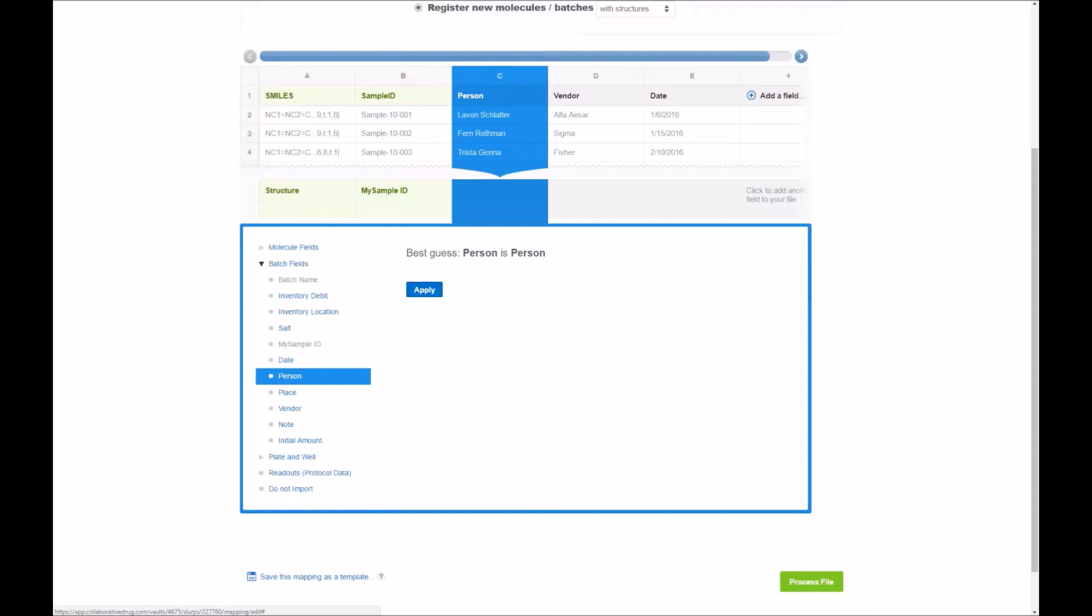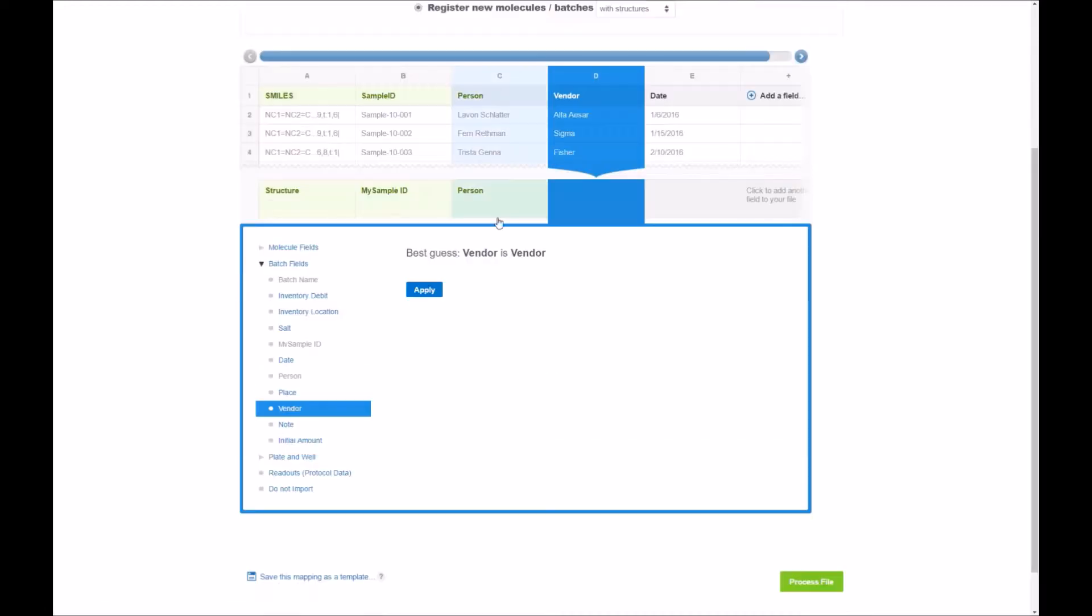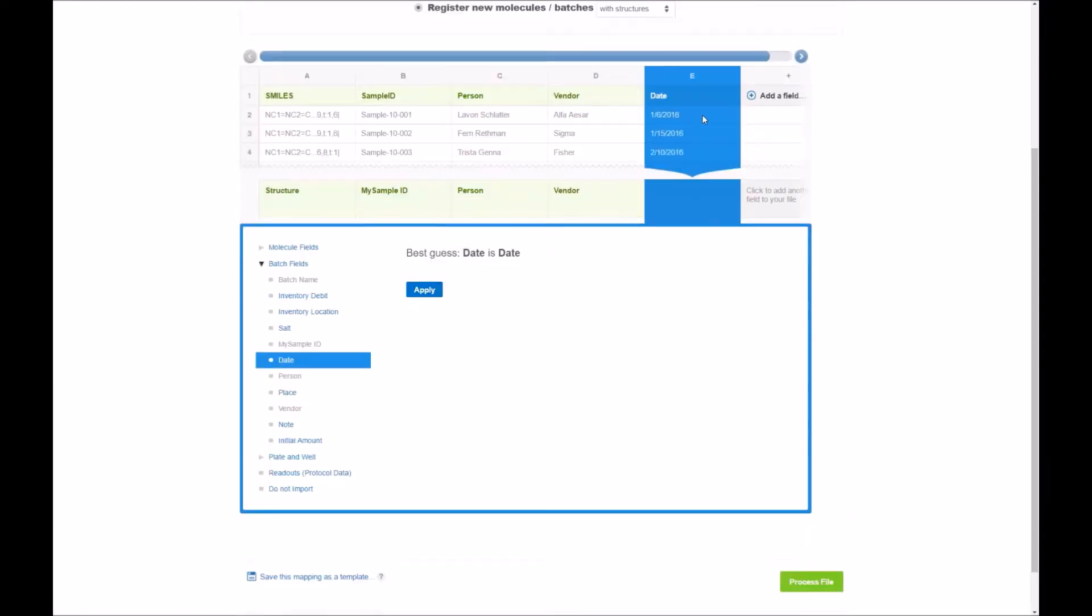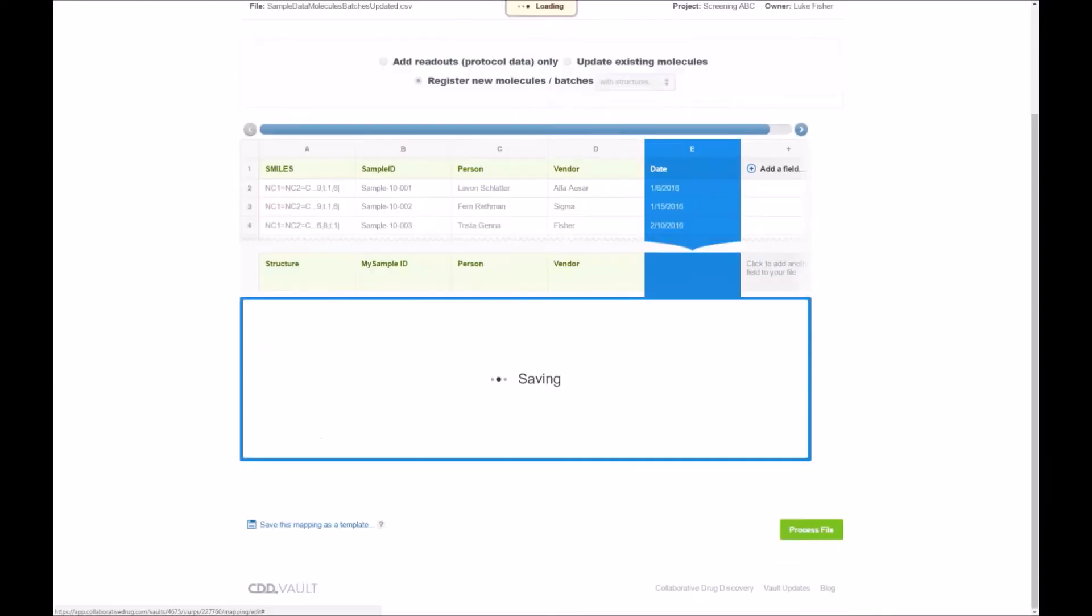Here's the person mapping to person and clicking apply there. Vendor mapping to vendor and the date mapping to date.